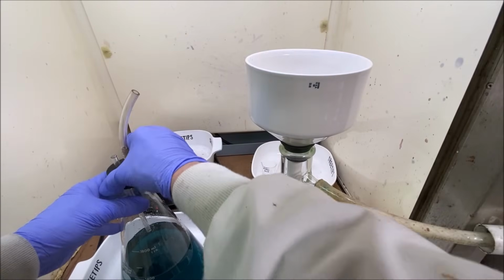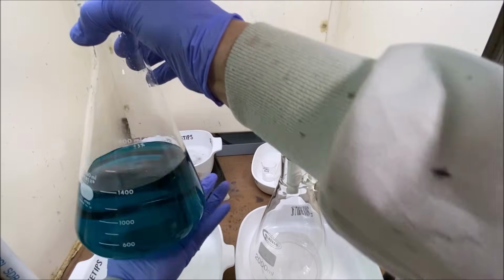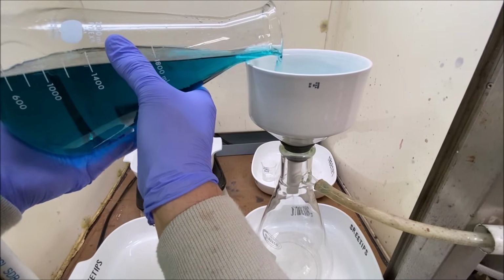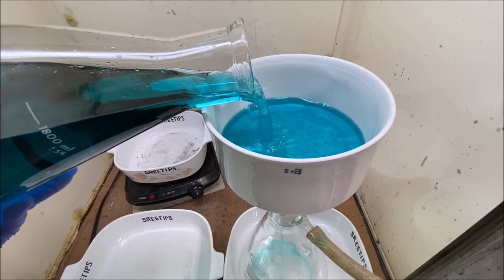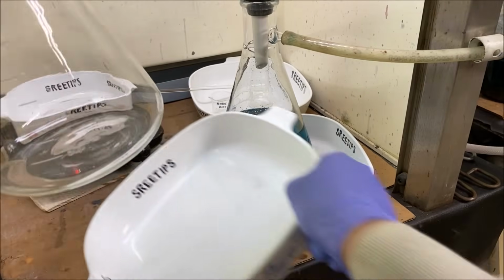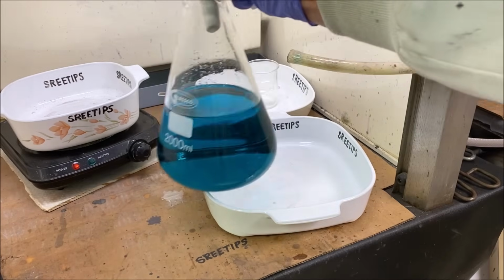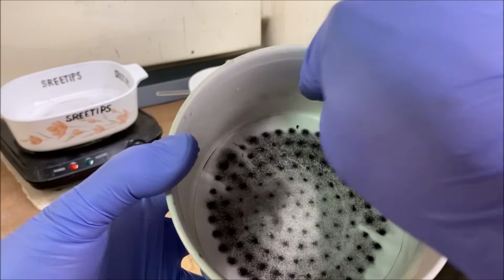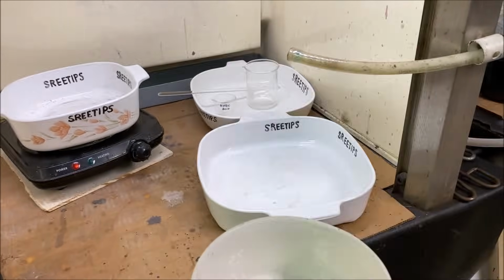Now what we'll do is filter this liquid that we just drew off of the solids. That didn't take too long to pull through this filter. Let's pull this down now. Have a look at it. There's what's left in our filter. I think I'm going to pull this out and put this in my paper storage.